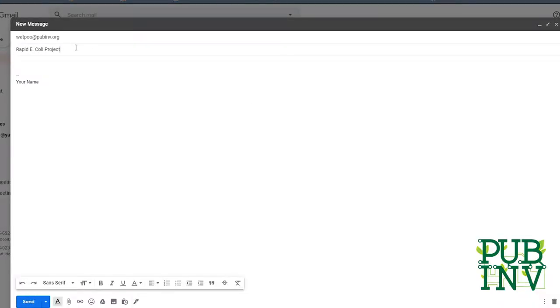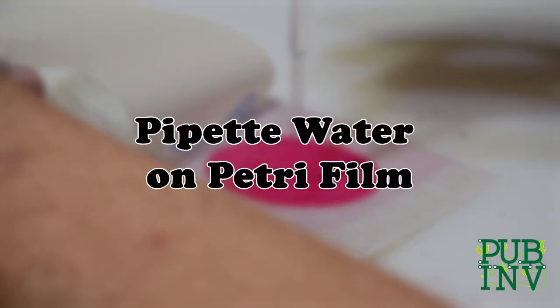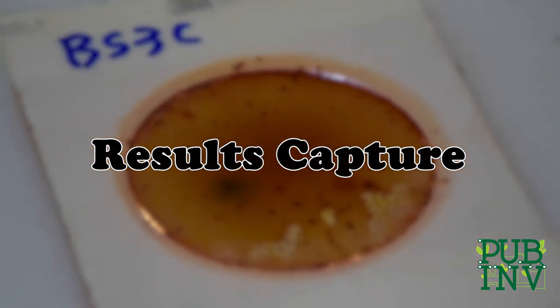To help us with our data collection, we request that you email a picture of the water source and the petri films. Be sure to include the name of the body of water and the city. Moving forward, this project can be broken down into 3 main steps: water sample collection, pipette water samples onto the petri film, and bacterial growth and results capture.